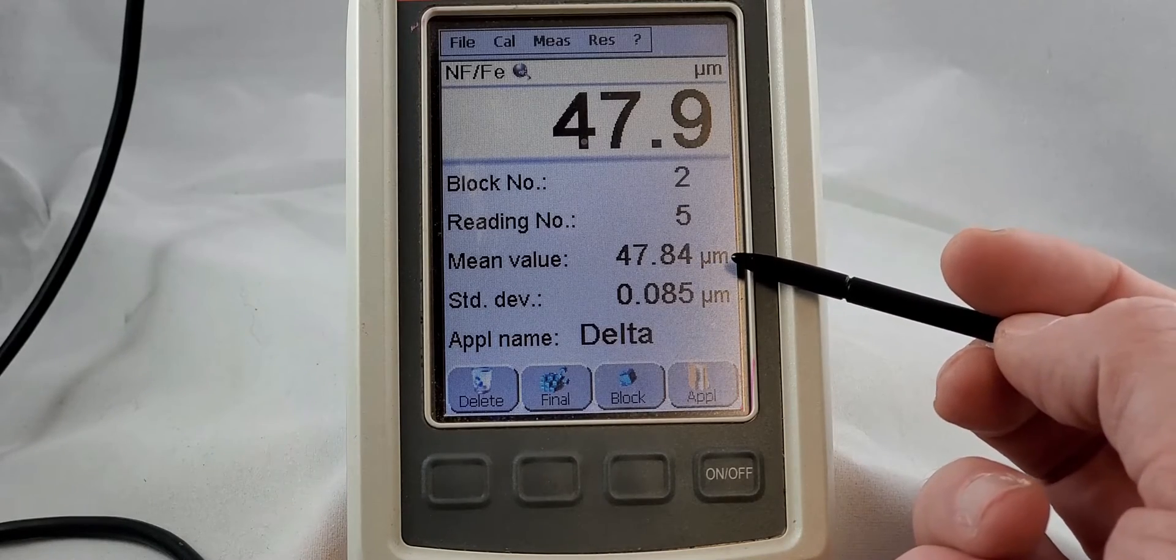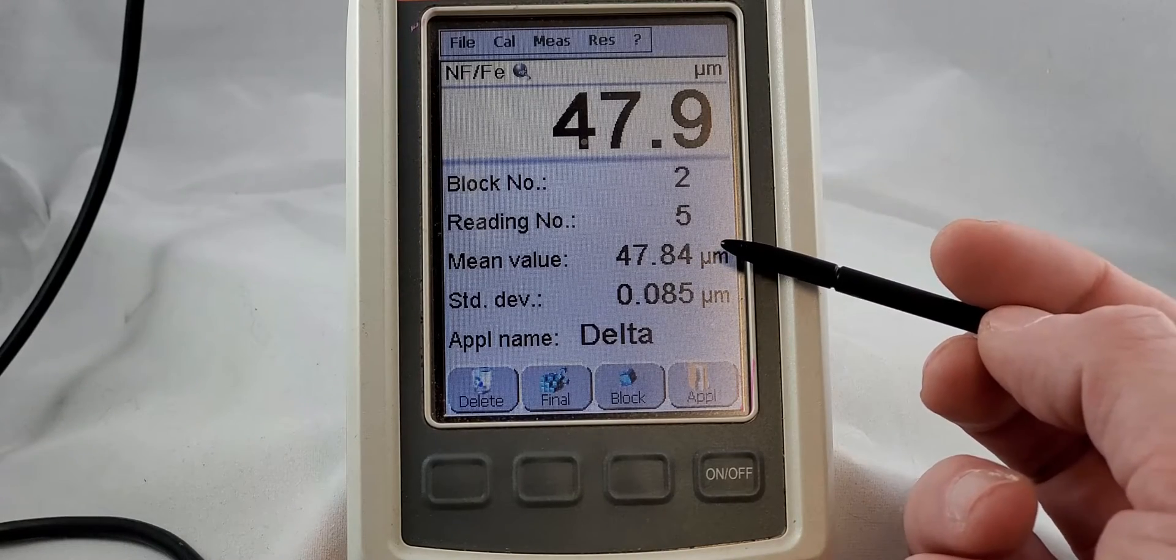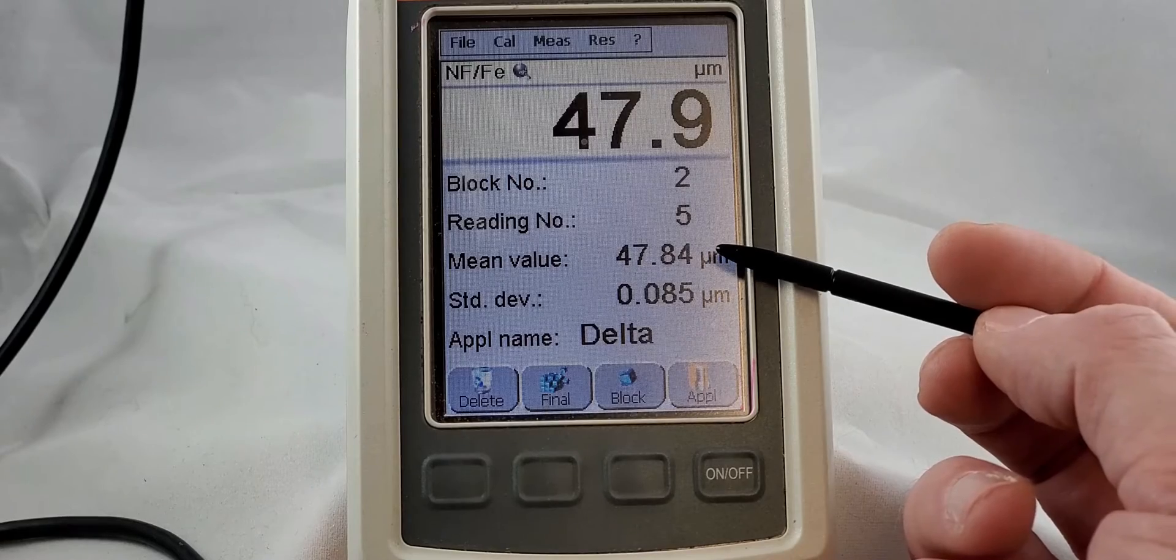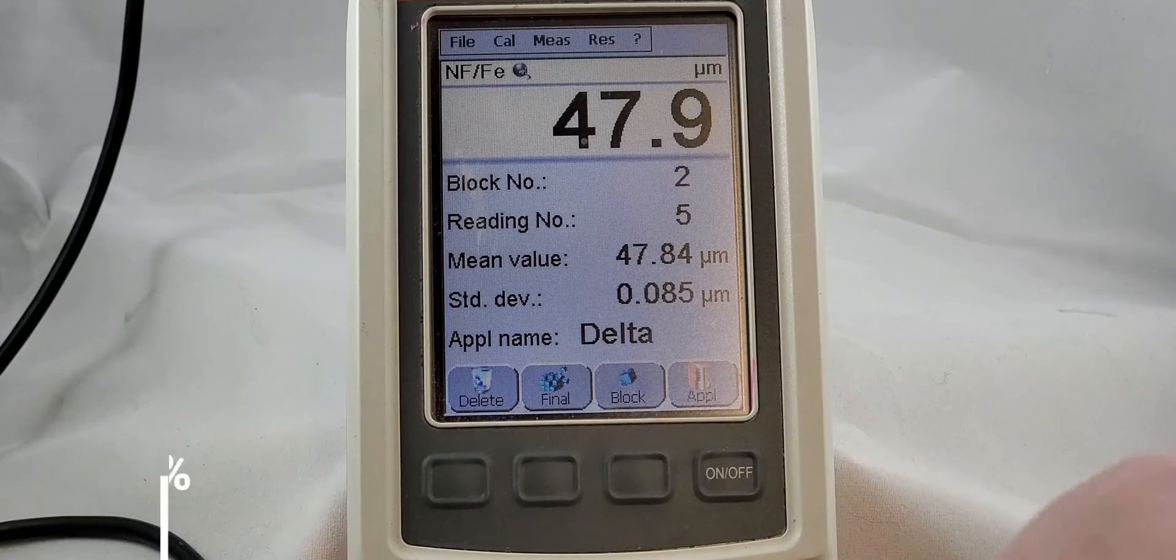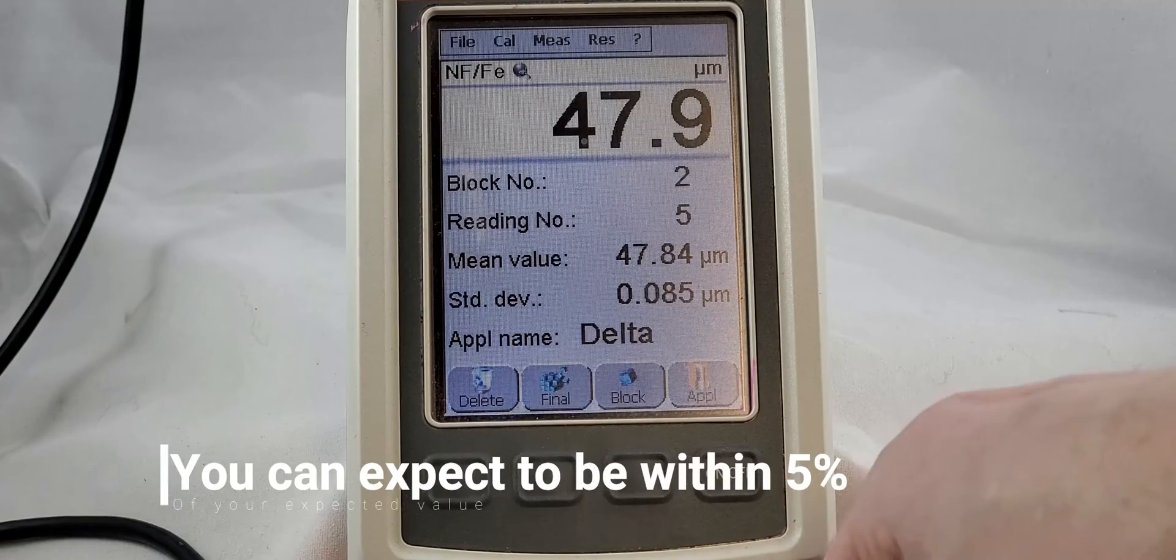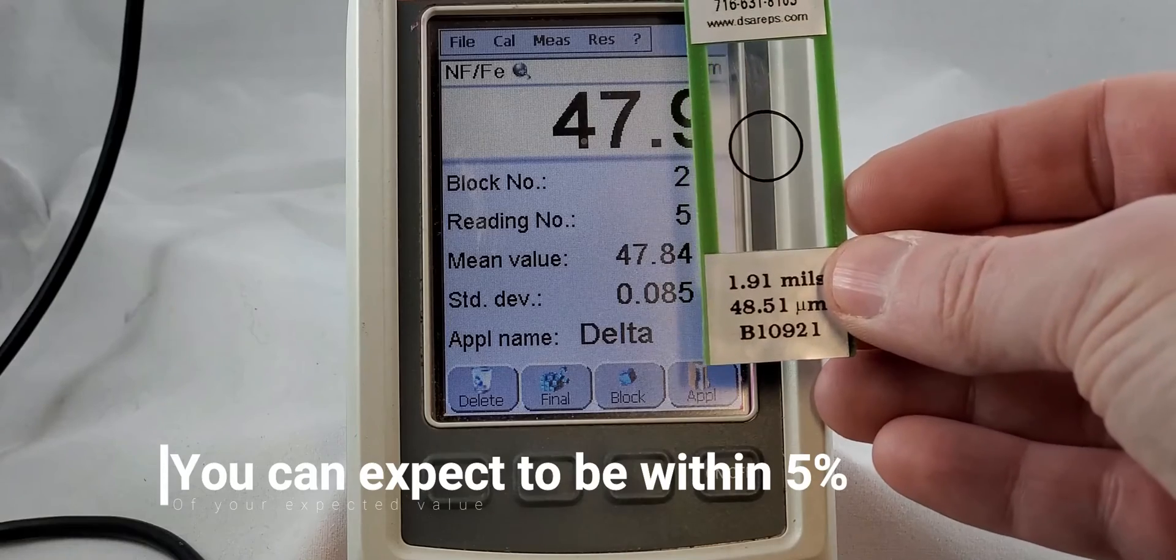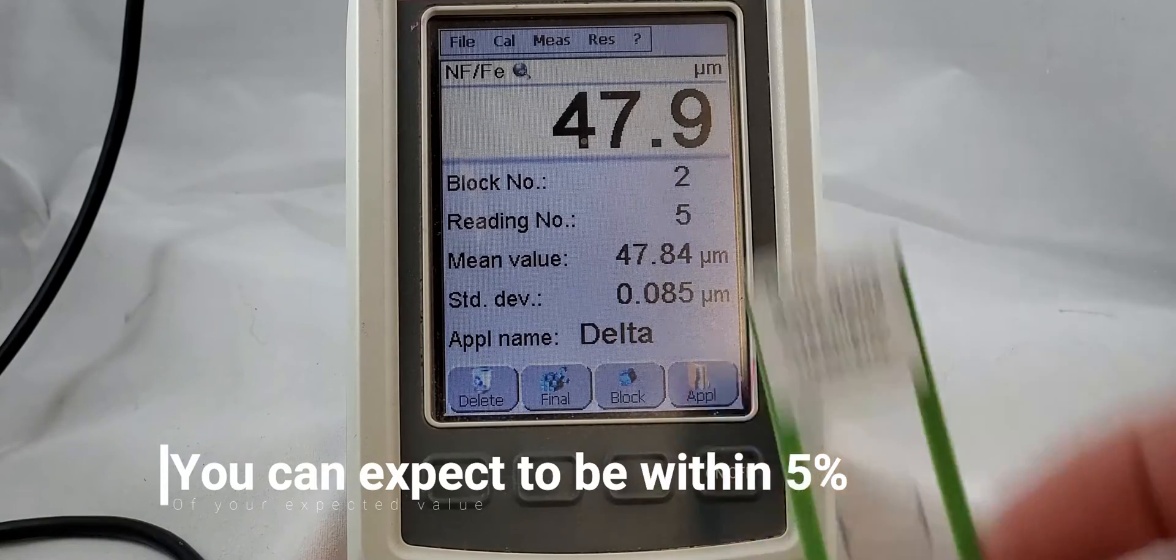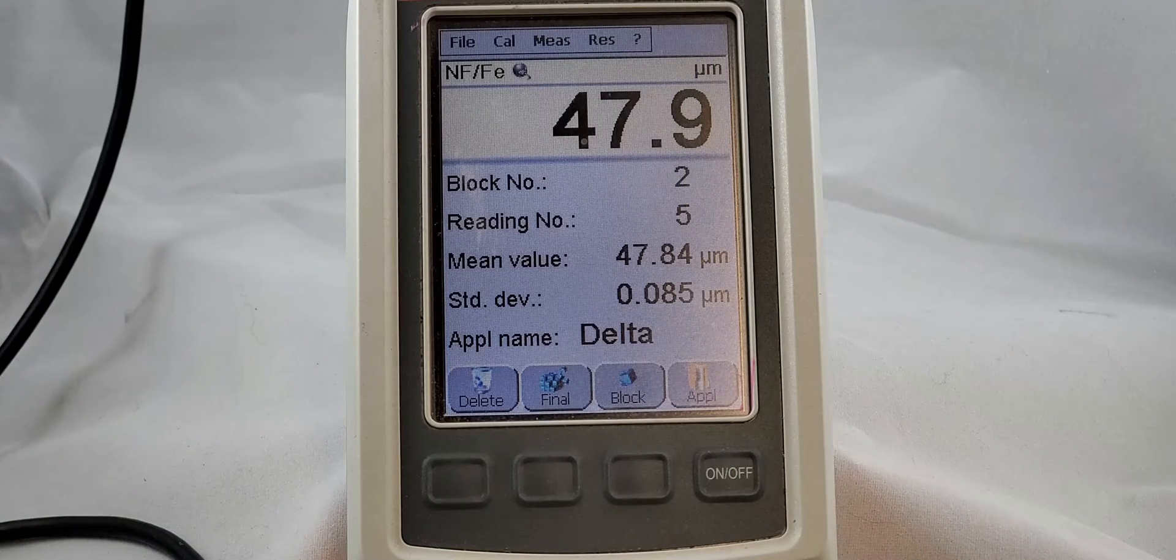Nice thing about the FMP 100 and 150 - we have got the mean value right here. We don't have to go anywhere to find it or do anything else special. 47.8 on a 48.5 micron foil is fantastic. Calibration done.